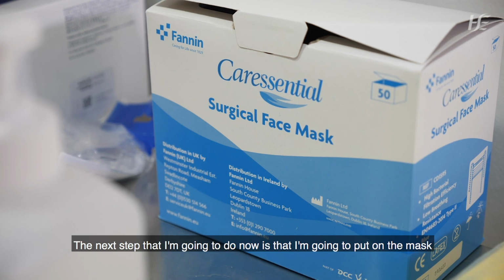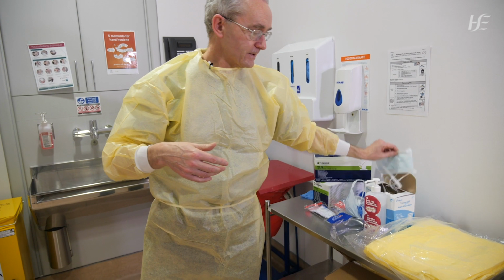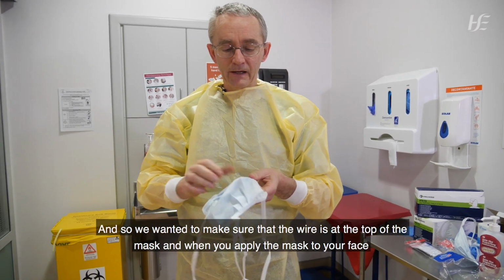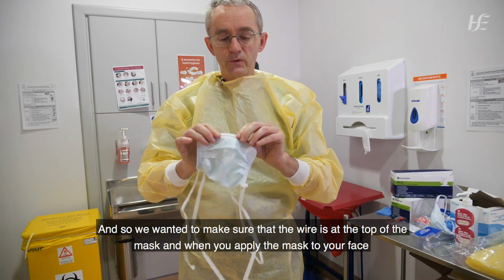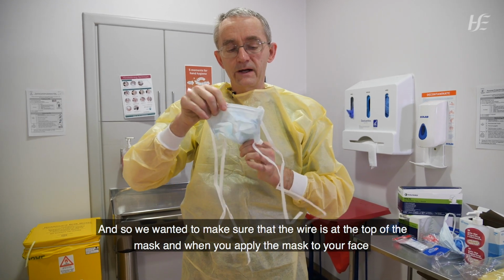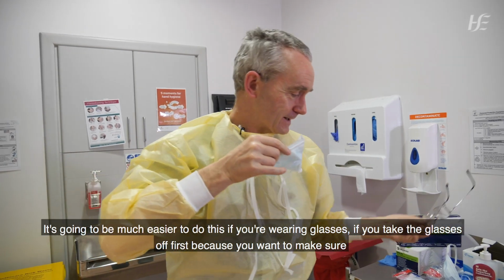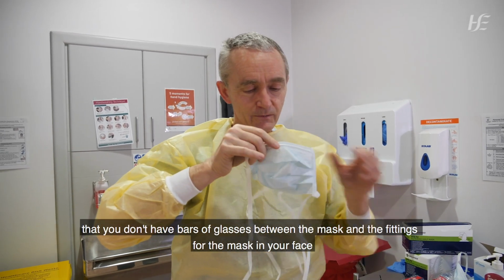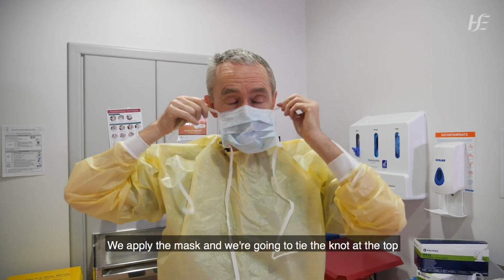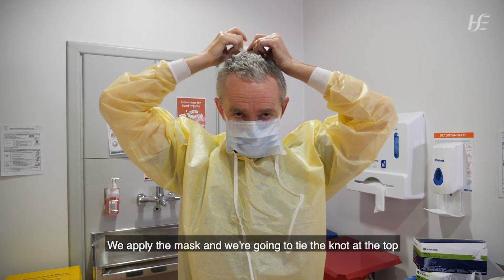Okay, so the next step that I'm going to do now is put on the mask. I'm going to demonstrate first the use of the surgical mask. We want to make sure that the wire is at the top of the mask, and you apply the mask to your face. It's going to be much easier to do this if you're wearing glasses, if you take the glasses off first, because you want to make sure you don't have the bars of glasses between the mask and the fittings for the mask on your face. So we apply the mask, and we're going to tie the knot at the top.